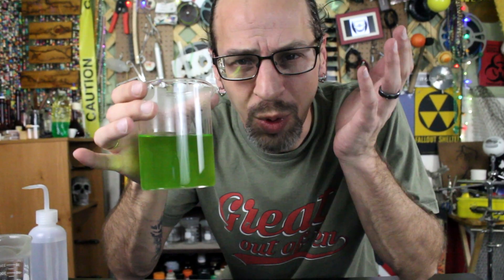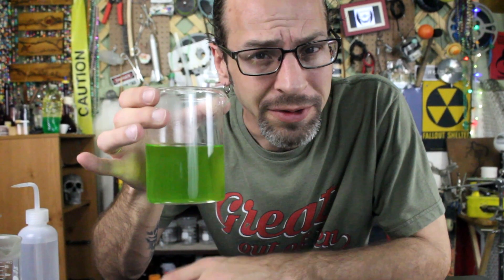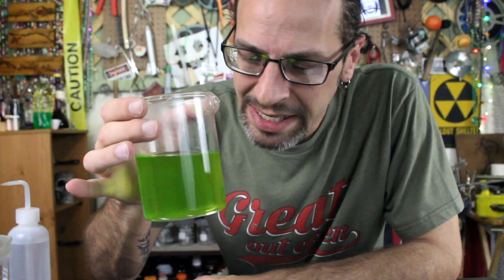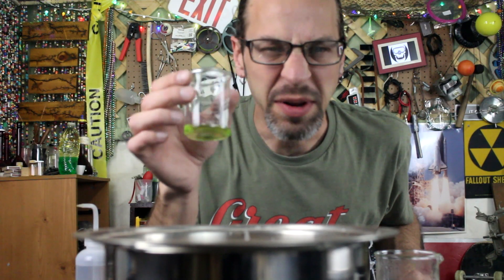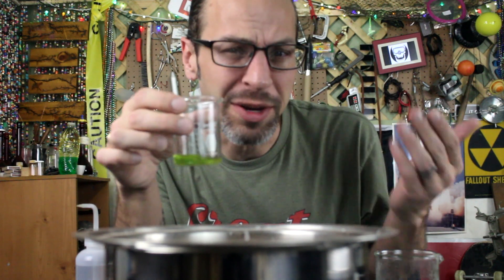There are a couple of different ways we can do this. The best way — the way we're going to get the best results — is to let it slowly crystallize. If we let it cool off slowly and evaporate over time, it will create some very nice large crystals. But I'm being a little impatient tonight, so before we go too far, we're going to heat it up a little bit and concentrate the solution by evaporating some of the water off.